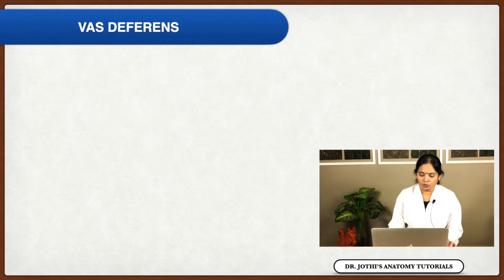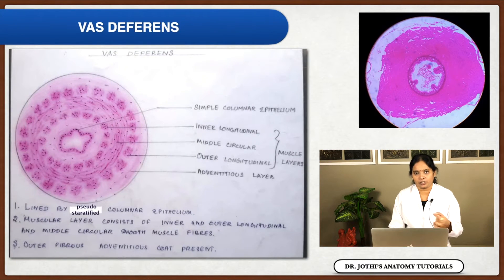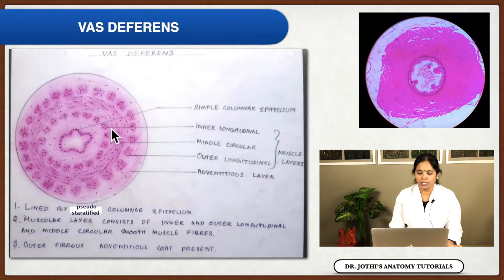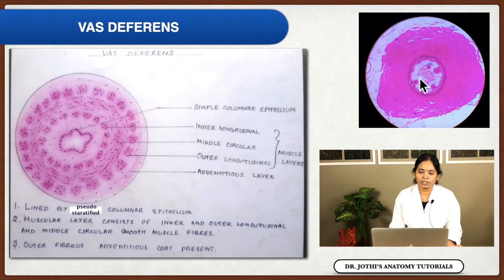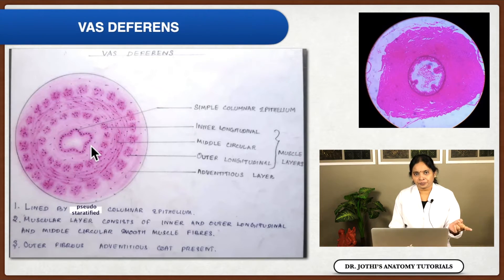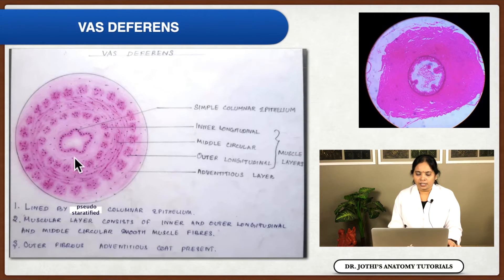The next structure is the vas deferens. Once again, it is a highly coiled tubular structure. From inner to outer, it is made up of a mucosa, then a muscular layer, then an adventitial layer. The mucosa is thrown into folds, giving a star-shaped lumen. The main difference between the vas deferens and the ureter is the lining epithelium — here it is pseudostratified columnar epithelium, whereas in the ureter it is transitional epithelium or urothelium.